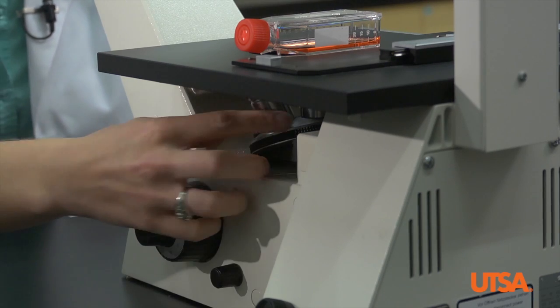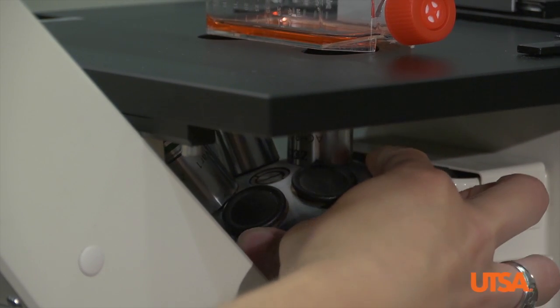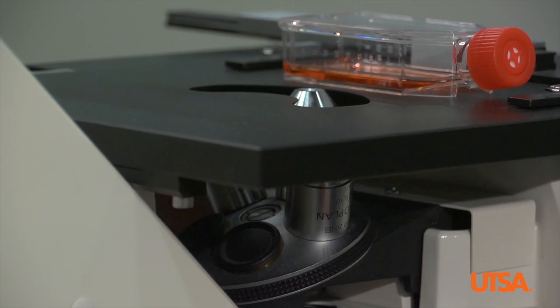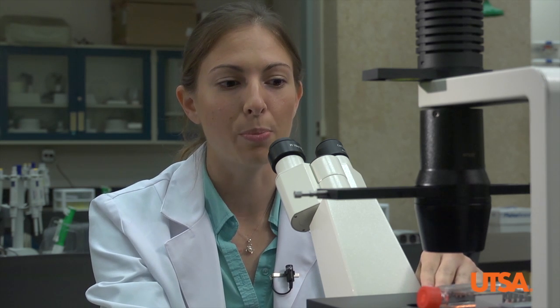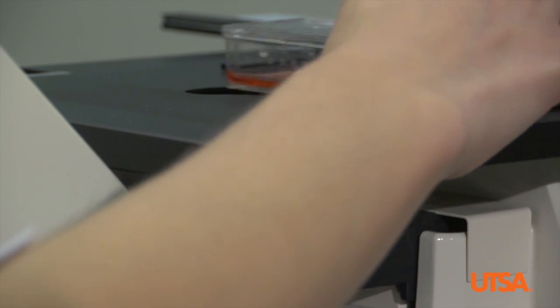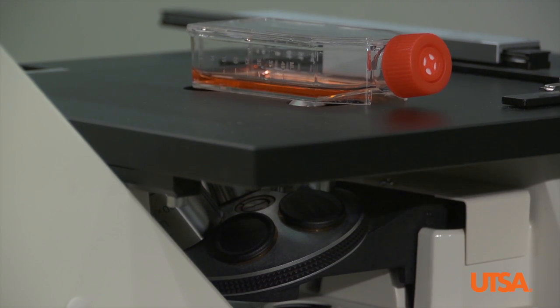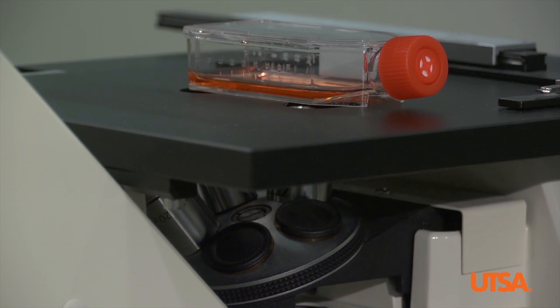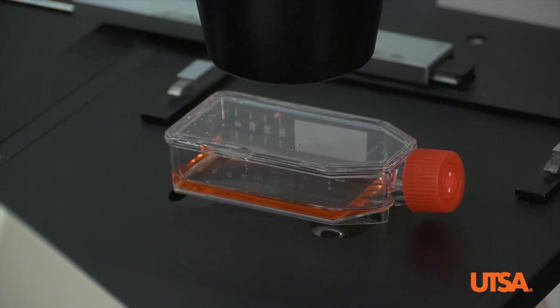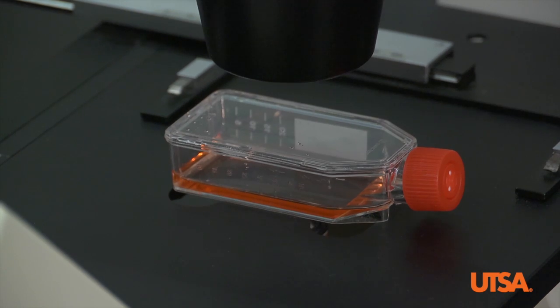Now it's time to start magnifying. I recommend that you start with the lowest objective setting — for this microscope it's a 4x. As with traditional light microscopes, it's possible for the objective to come through and hit the specimen, so move the objective lens so it's almost touching the flask. That way you can only back up and won't hit the specimen. Back up using the coarse adjustment knob, and once you maintain focus at the lowest magnification you can increase the objective by turning the objective wheel. You may need to use the fine adjustment knob at this point, but the majority of your focus should still be maintained.